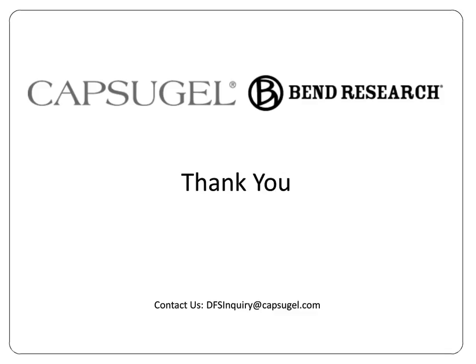As well, we have the SP200 and the SP100, which is a larger sampling valve, and we can use steam or liquid sanitant to clean those valves based upon our client's specific sanitant of interest. That's actually a discussion point with our clients, which is what sort of system do you envision this being used on? What sort of sanitant is used in your setting, and how do you want to maintain cleanliness and setup of your bioreactors? That's really how we manage sterility and basic bioreactor hygiene using our physical setup with our hardware tools.